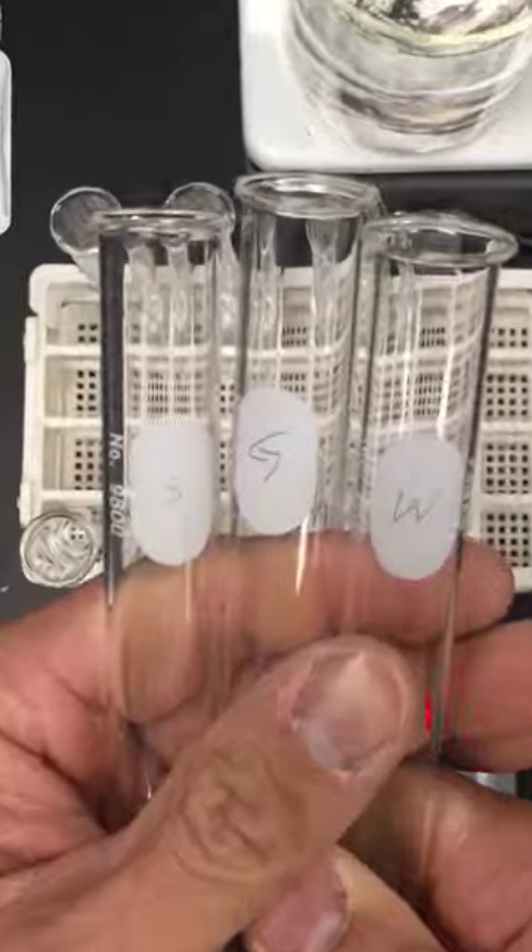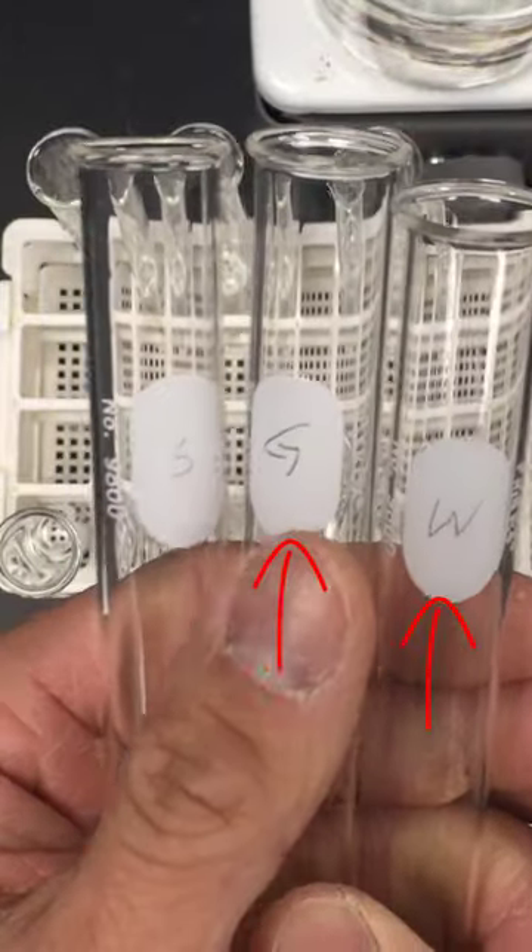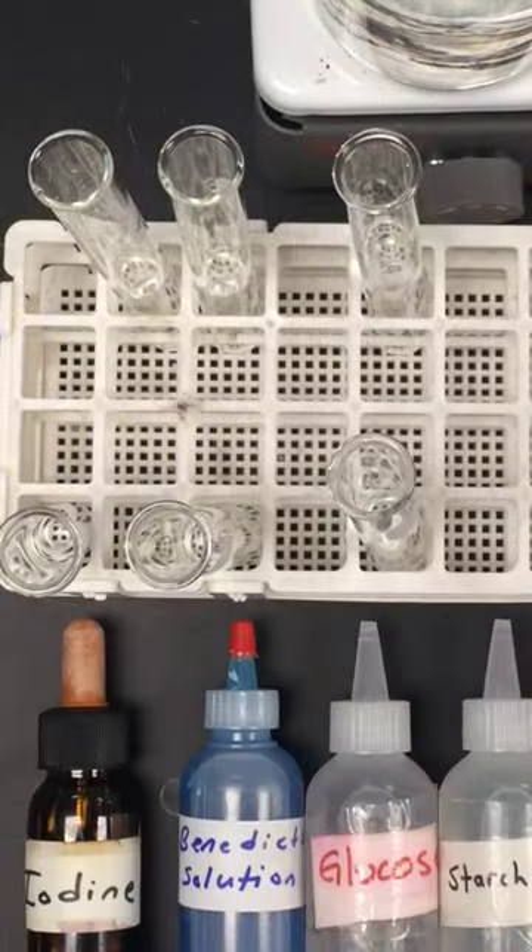Before you get started, make sure you label your test tubes. You should have three test tubes labeled W for water, G for glucose, and S for starch. This way you can identify which test tubes are which, because the solutions are clear.